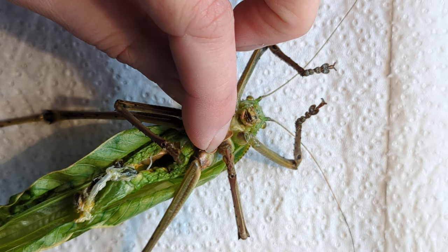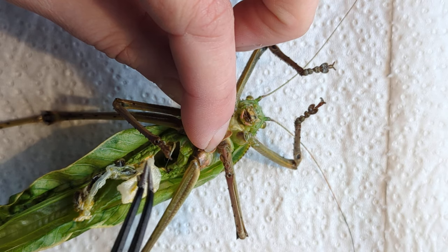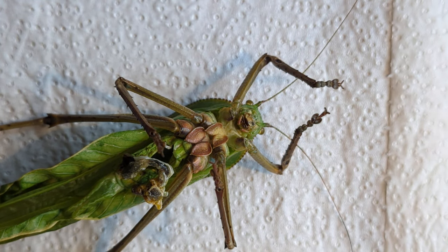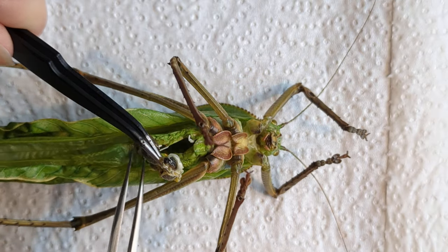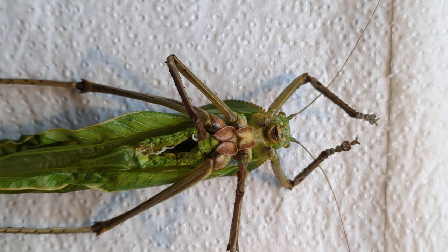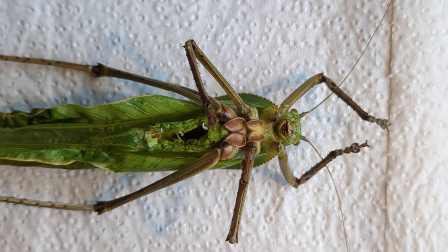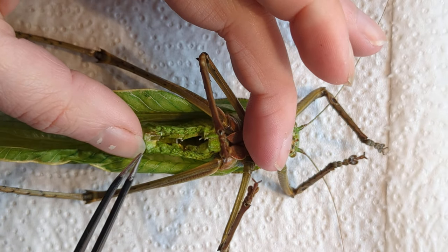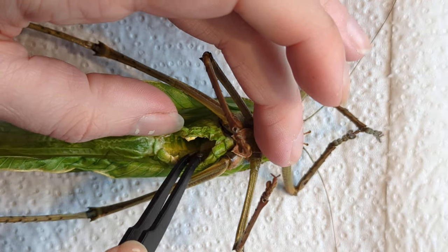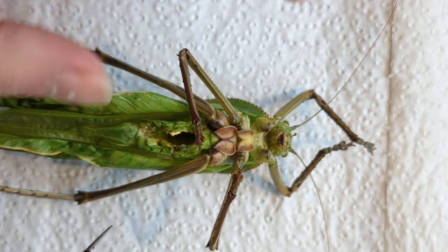These guys feed, in captivity, on a diet of bramble leaves. They're quite easy to raise. So that's what you're seeing here — digested bramble leaves. I'm going to get that second pair of tweezers and pull that out. That is almost everything out of there. The bigger the insect, the easier this is to do because you can open up the entire body cavity and see.